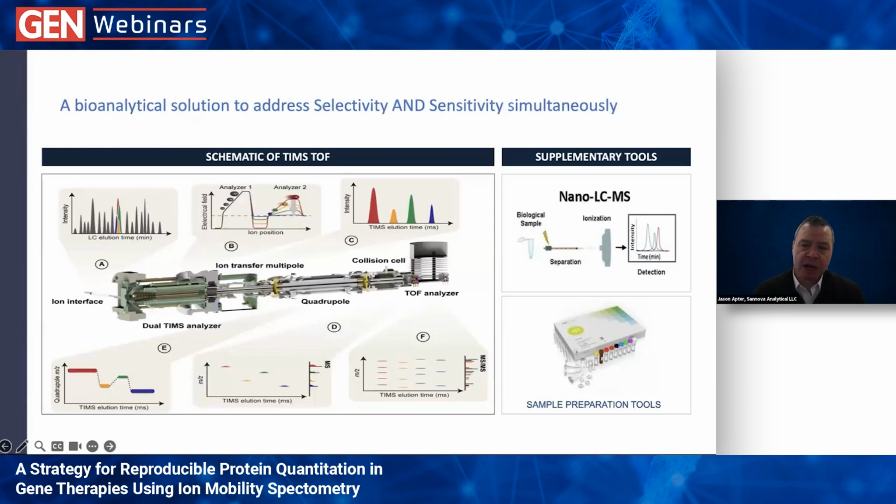Mark, I'd love to hear just your thoughts, having been someone that's seen this firsthand and maybe seen this up against some of the traditional methods, on some of the benefits and even some of the opportunities or challenges that are still relevant to make this a viable bioanalytical solution for drug developers in gene therapy. Yeah, in the relatively short time that I've been involved in this particular project that's taking advantage of this, the degree of sensitivity is night and day compared to immunoassay-based approaches.